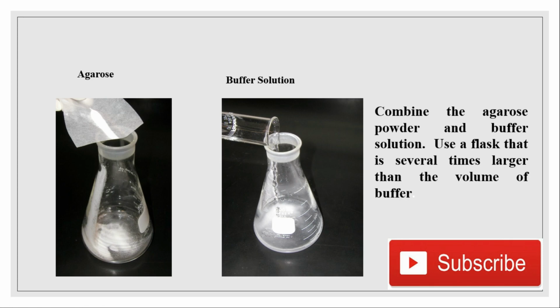In this picture you can see the agarose and the buffer solution, and we dissolve it by giving 3 to 4 minutes in the oven to dissolve the solution properly. Use a flask that is several times larger than the volume of the buffer, because in the oven it will boil and move outside if the flask is small.